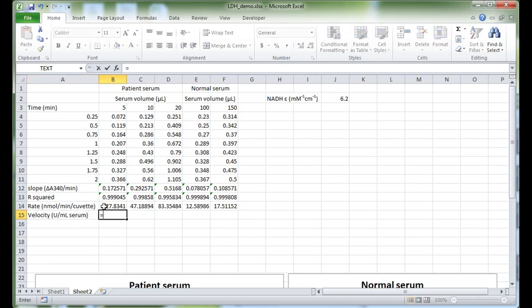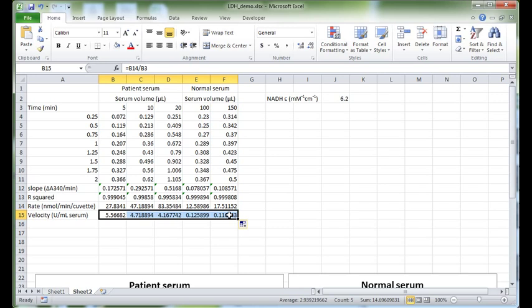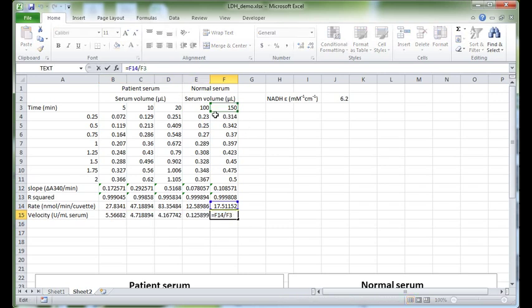So that was equal to the rate simply divided by this number 5. Remember how I said at the beginning that we put numbers into Excel, and we don't just put our 5 ULs here, for example, because otherwise Excel can't use that number 5. But if we put the number 5 by itself, Excel can go in and use this number for our calculations. So B14 divided by B3, press enter, and this time we can drag across without using any absolute referencing because we want it to update, both the green and also the blue.